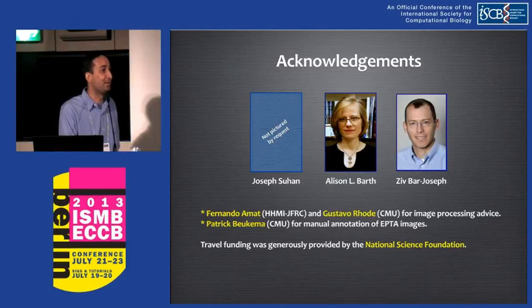I didn't want to do all this labeling myself, so I tried to do something unsupervised. I found some sets of parameters that worked pretty well, but the main problem was that these parameters didn't generalize when I got the next sample, and I saw a lot of variability in the stain. In theory, there's some way of embedding this into another space where that's going to be preserved, but we had a hard time doing it without generating at least a little bit of training data.